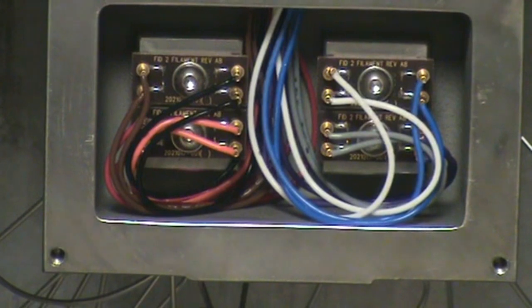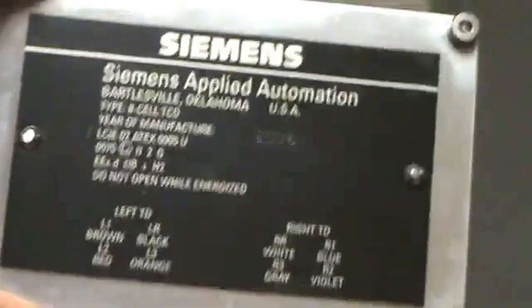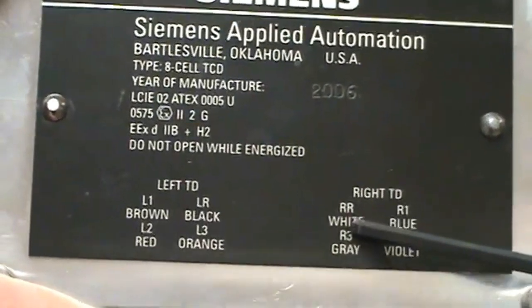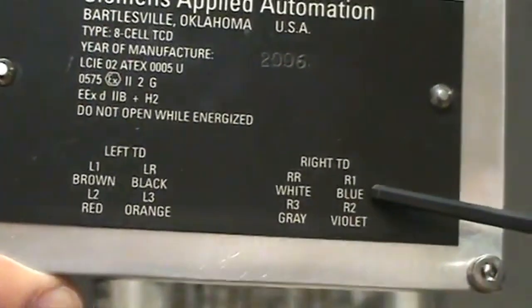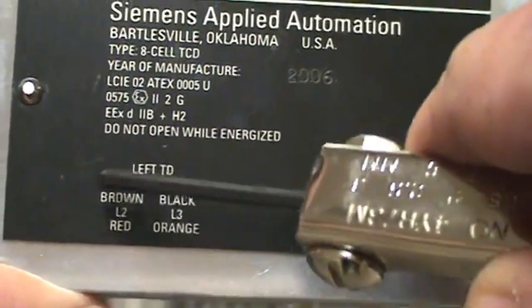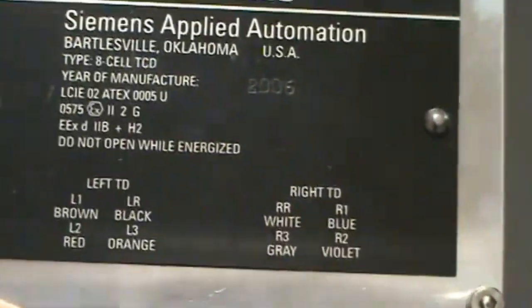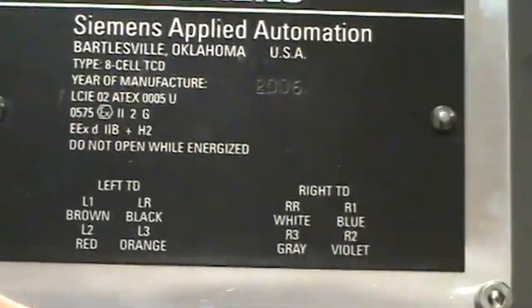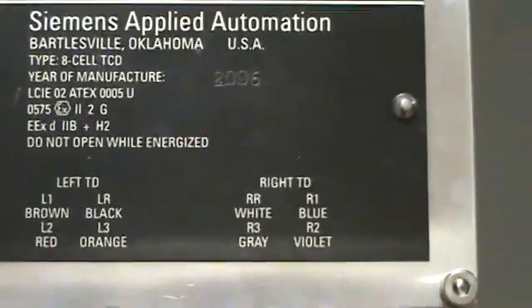All right? And you're going to be looking at, so that one is going to be right reference, bead 1, bead 2, bead 3. Left reference, 1, 2, 3. All right? 1, 2, 3, pre-cut, main, back flush. Reference. Reference, pre-cut, main, back flush.